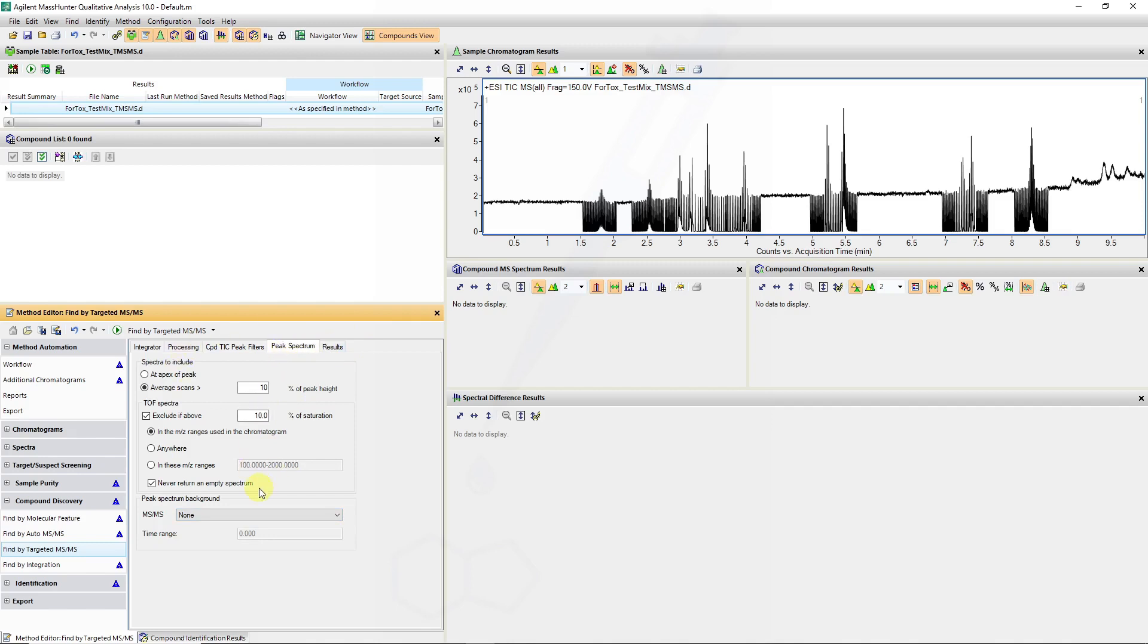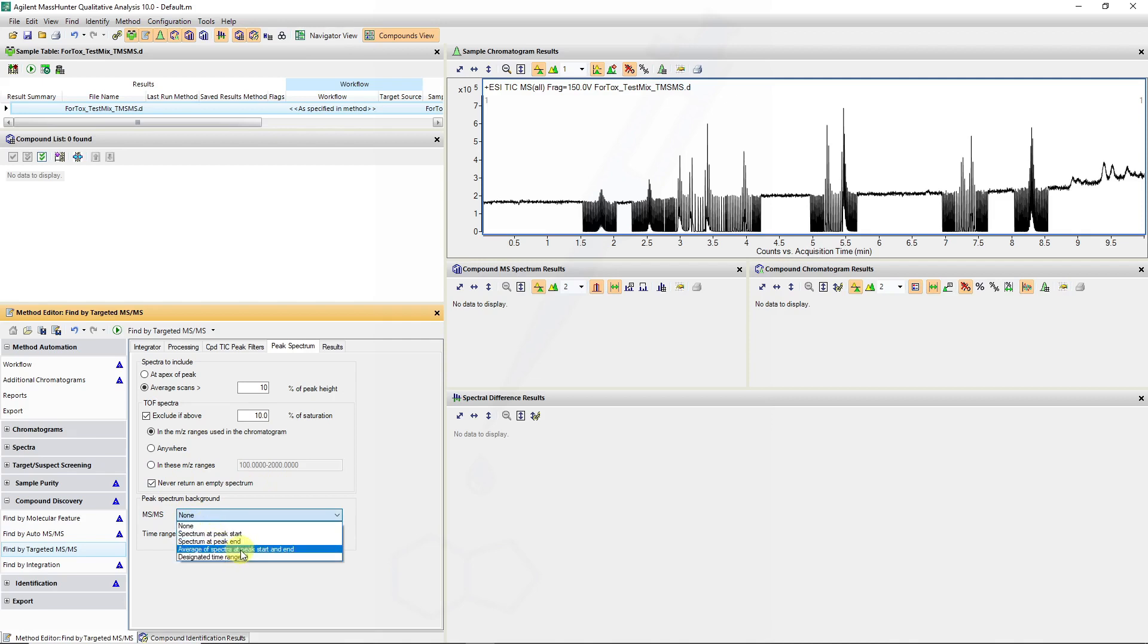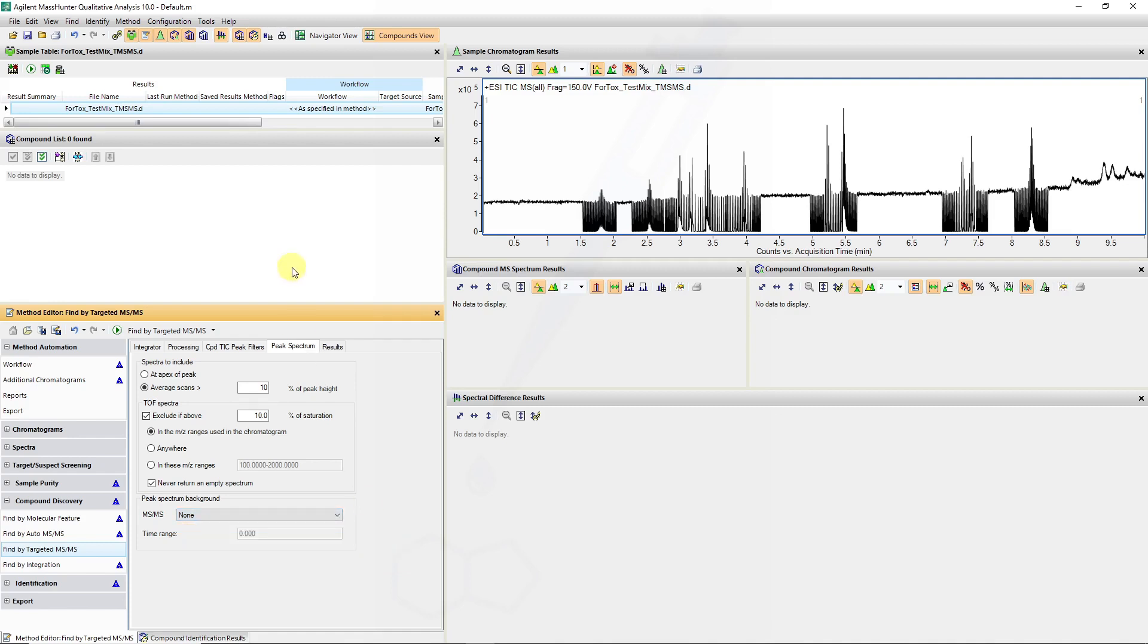For the peak spectrum extraction I will not do any MS-MS background subtraction, but this can benefit and it's worthwhile playing around with this parameter where you can average some of the spectra at the beginning and the end of the peak which is subtracted and it might clean up some of the library spectra.